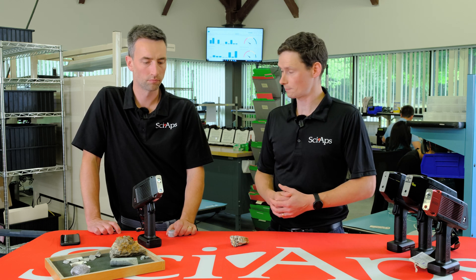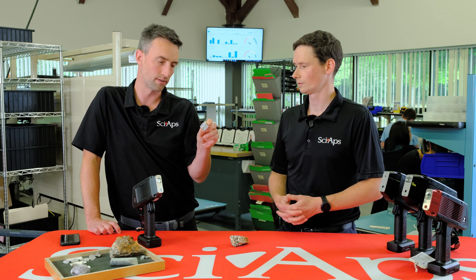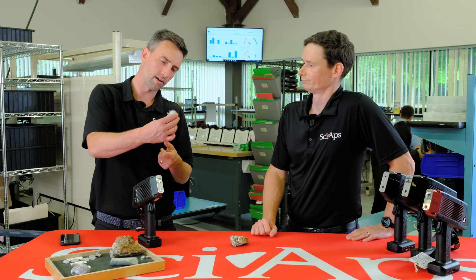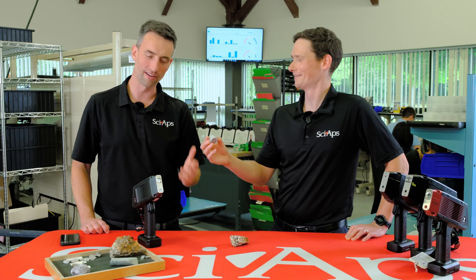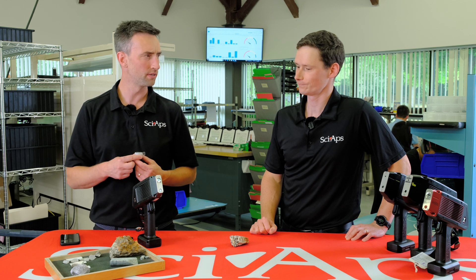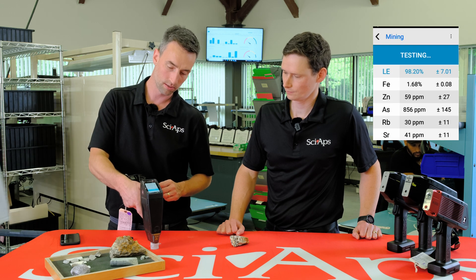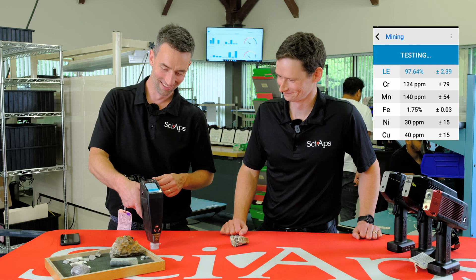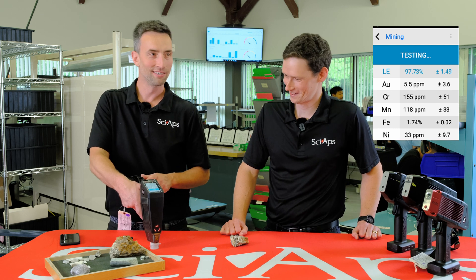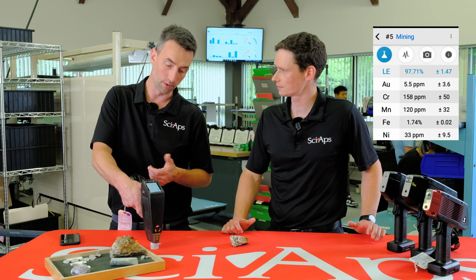So I see you've got a sample there. Yeah, we've got Aureus 279 — this is a standard from Ore Research out of Australia. This is low gold; I think it's like seven parts per million gold. We're going to take a shot here. That comes in at 5.5 ppm. How long was that test? That was a 12-second test.